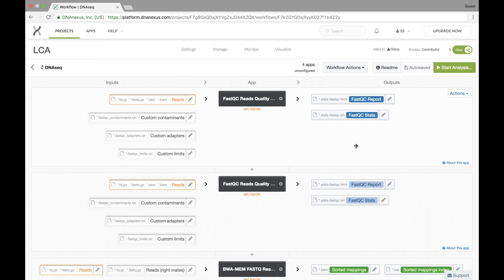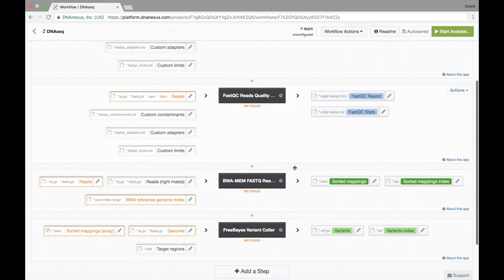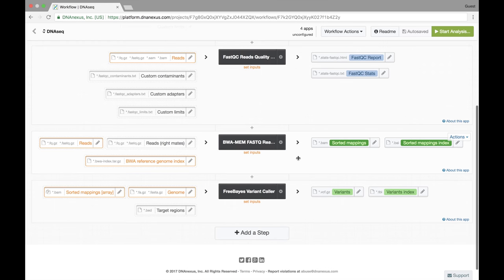And I'm going to close this window. And let's do a quick review. FastQC for the forward and reverse read into BWMM and closing out with Freebase. However we're not done yet.